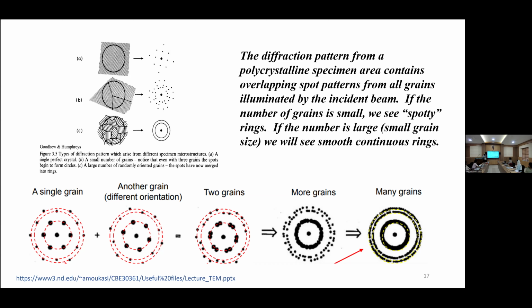And then the same lattice in another orientation. What will happen? Here, this is the same crystal plane in another orientation. So here you can see it like this, and here like this. So they will combine like this. This is how we get the SAED pattern for polycrystalline samples. So this ring corresponds to one peak in XRD, this corresponds to another one, and this to another one. Like this, we are getting SAED patterns in TEM.